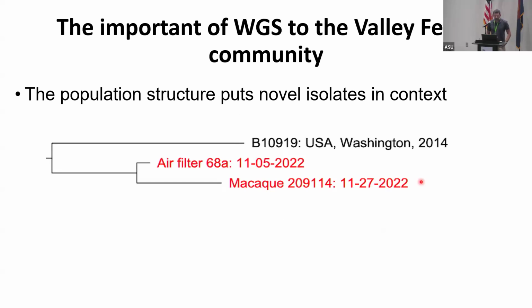So just to wrap up a little bit, the population structure that we've identified, we're going to continue to identify and put some of these novel isolates in context. This is a figure again from Dan and Nate's poster where we had an air filter enrichment sample.